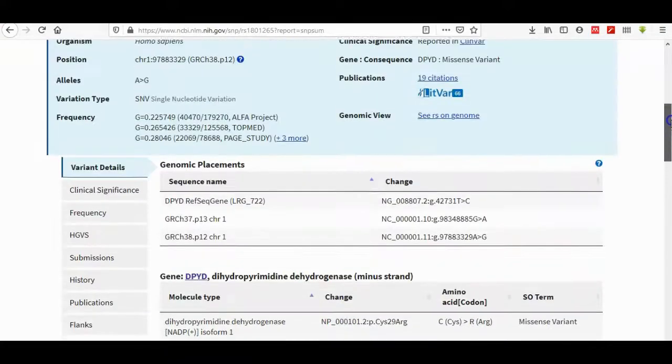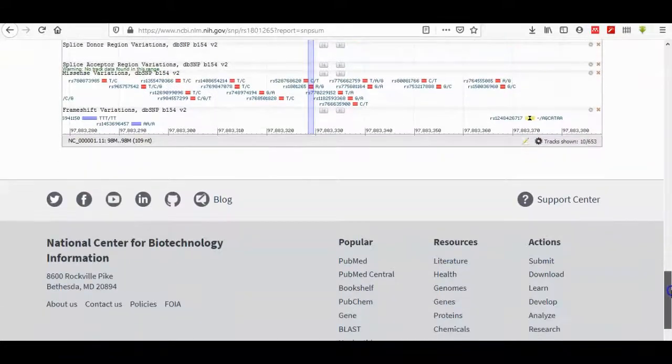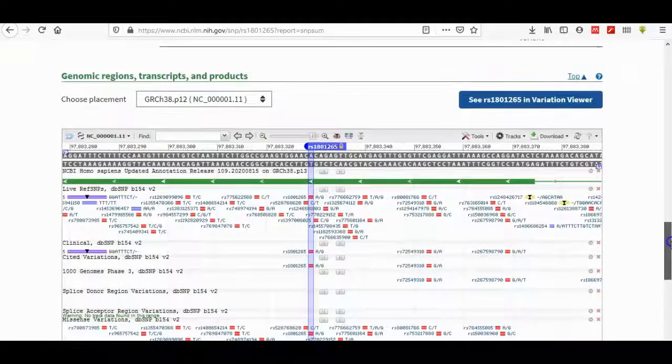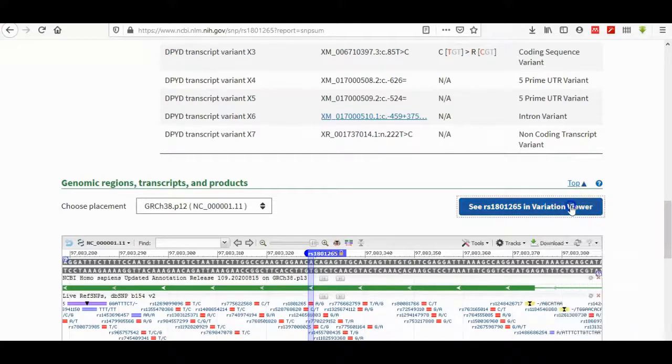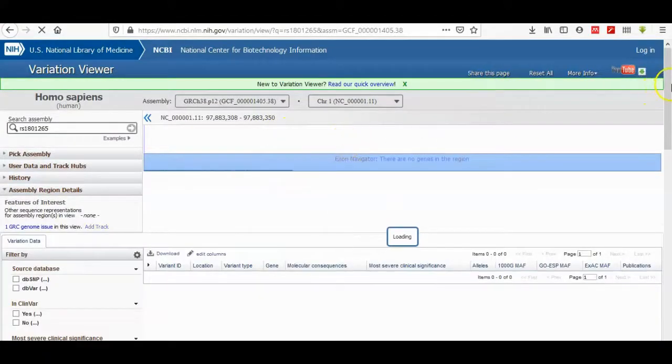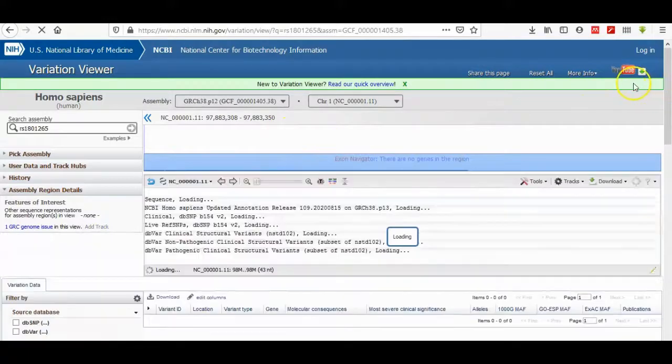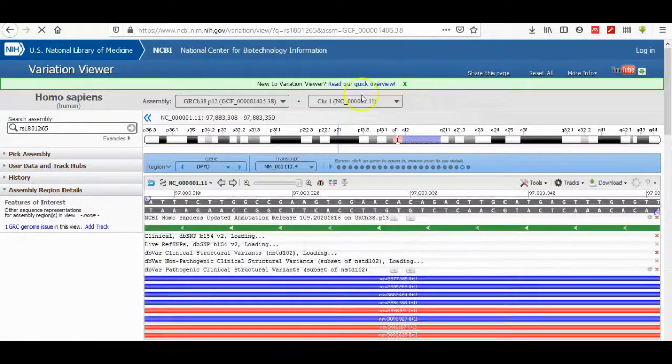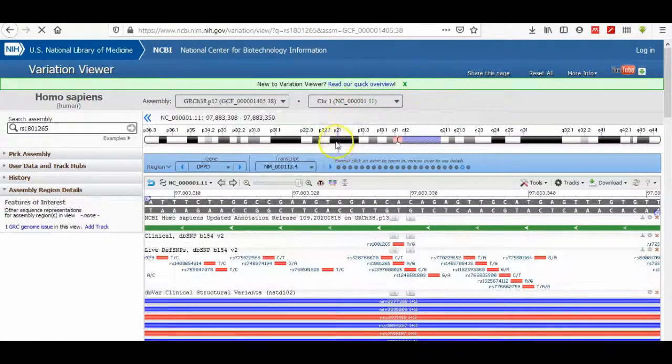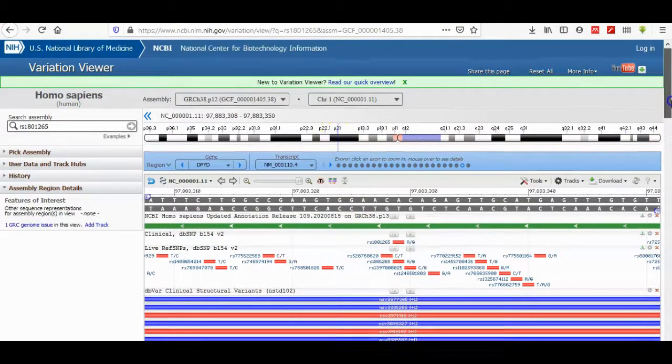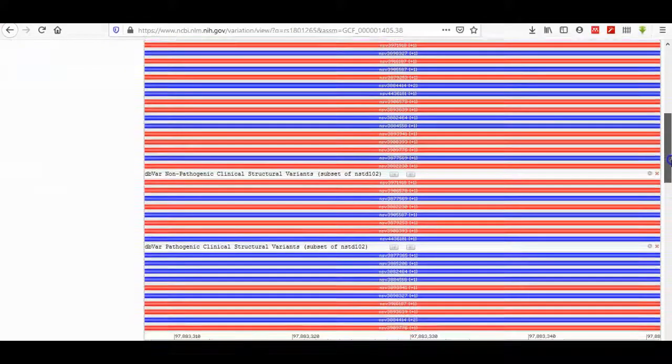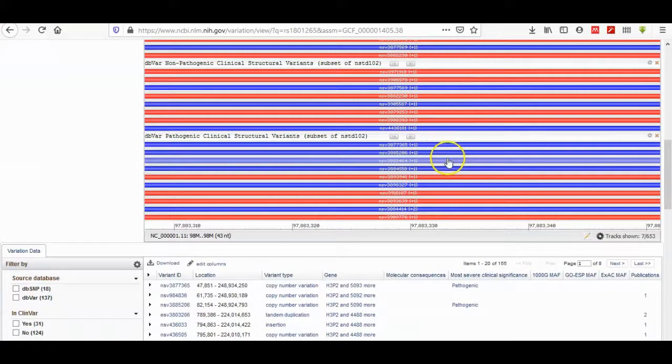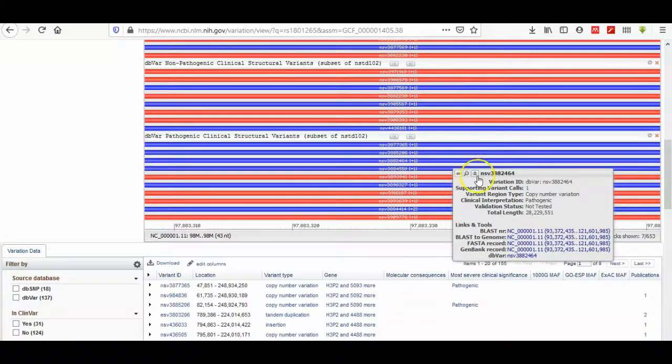Here is the SNP of importance. Here is genomic region or transcripts on products. Here you can see in variation viewer. Here is the variation viewer of your SNP. Here is in B21 the equation of it. If you highlight any sequence here, you can have a drop-down menu that has a lot of information.